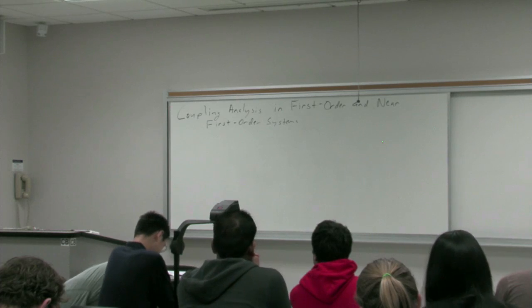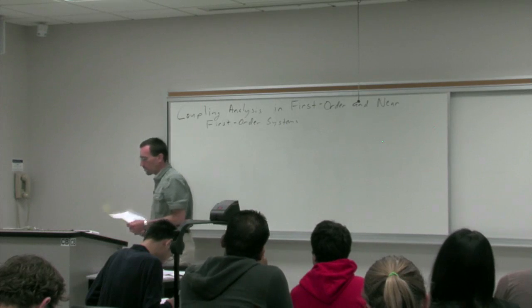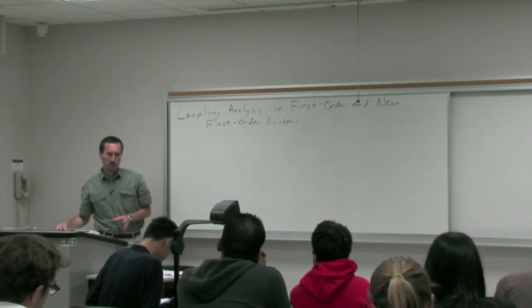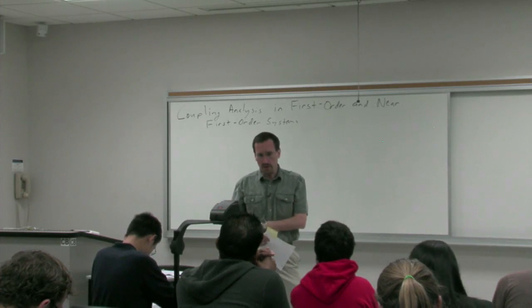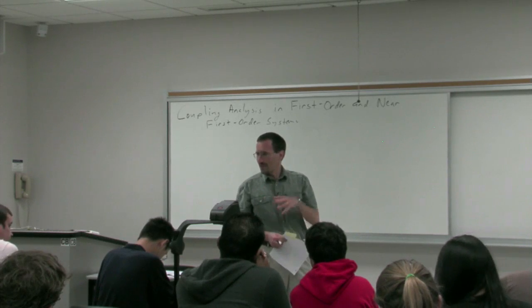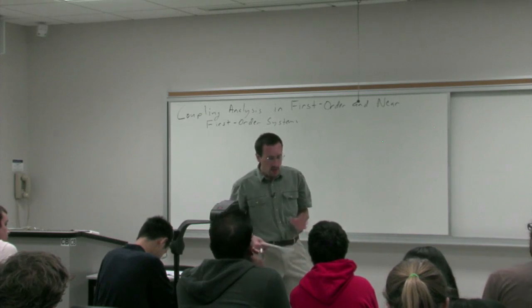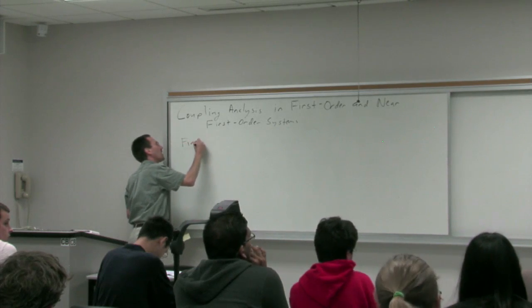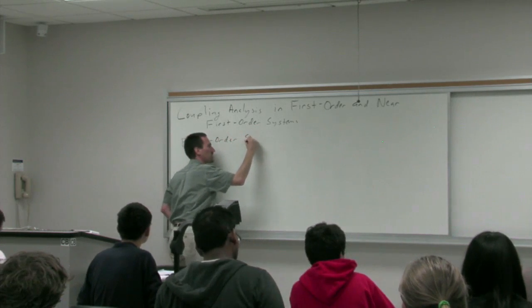I want to start by making the bridge between last time's lecture, where we talked about magnetic equivalence and non-first order systems. Last time was sort of the bad, and today is going to be the good. The bad is that a lot of the rules that you learned in simple sophomore organic chemistry really are oversimplifications. There are very few systems that truly behave in the way that you learn they should behave. These are the first order systems.